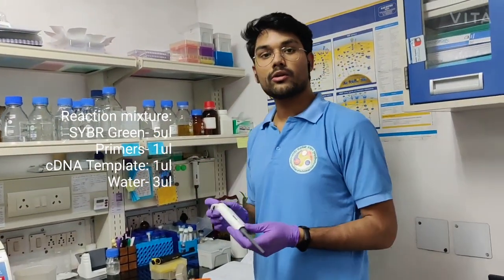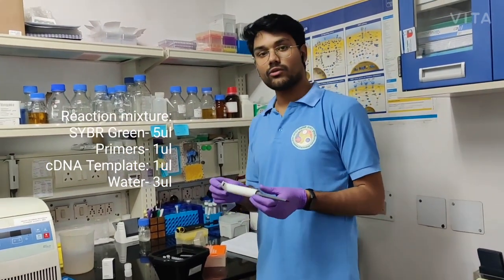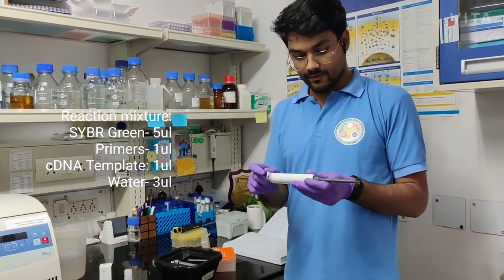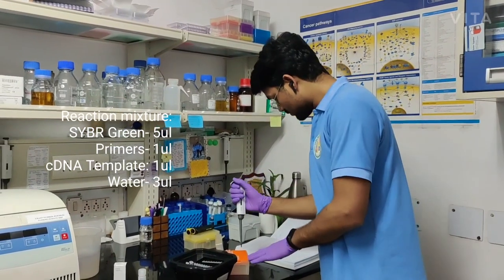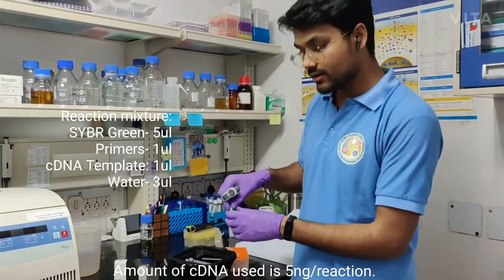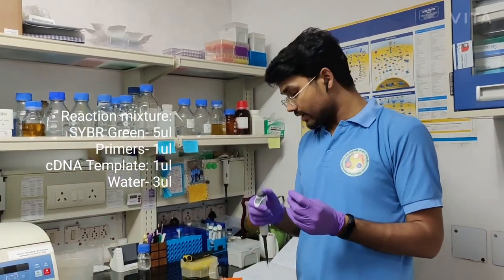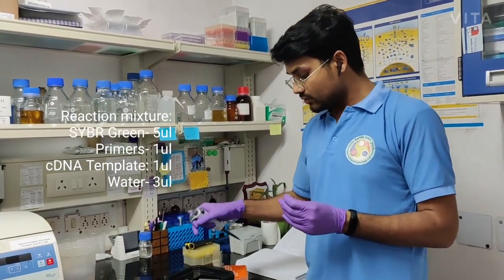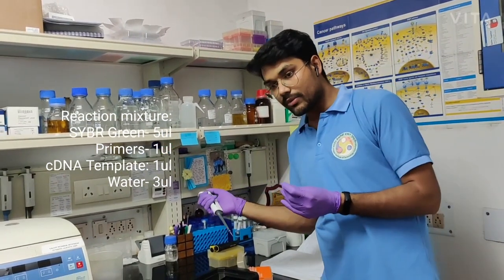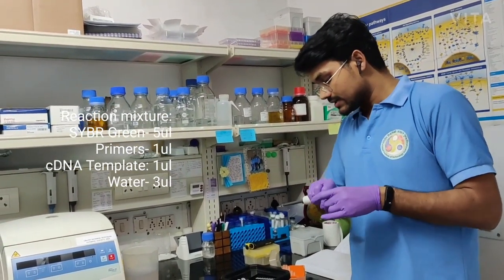Now I have added 9 microliter of buffer which contains SYBR Green, primer and water. Now the most crucial step is to add the cDNA, which is 1 microliter. So in 1 microliter of my cDNA, I will be adding 5 nanogram of cDNA. By adding an equal amount, 5 nanogram, into each well, I will be ensuring we have an equal amount of RNA so that we can compare the virus modulation or virus replication inside the samples.